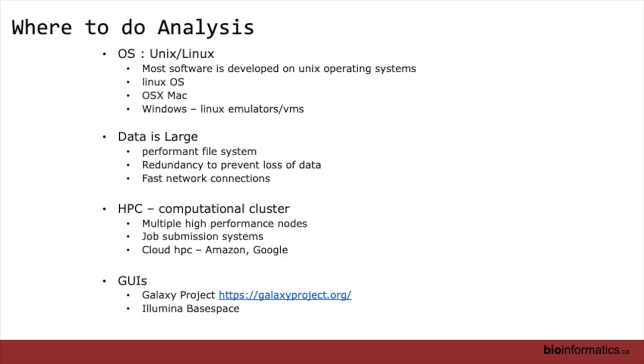Illumina BaseSpace has a similar thing as well. If you're working with their data, you can put it directly up into BaseSpace and run a lot of the routines in that location. And it's got a lot more point and click. It's a bit easier to work with, but really all these things are doing this in the back end. I mean, it's running software mostly on Unix-based systems. Which is what I'm going to show you in the next day.